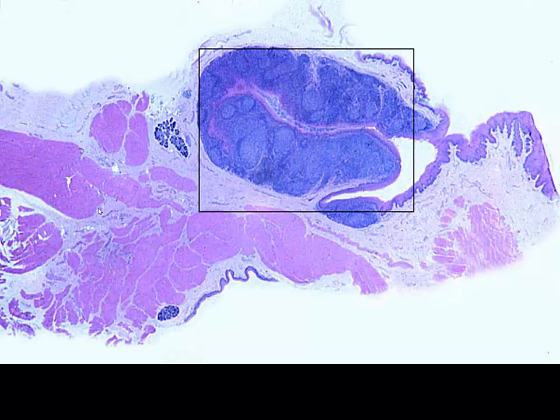Now, finishing out our encapsulated lymphoid tissue, we once again are looking at palatine tonsil. Again, this is what we saw in lecture. And we're going to expect to see the oral mucosa on the free surface. We're going to expect to see 10 to 12 or so tonsillar crypts. Now, in the plane of section, again, like this one, we just see one.